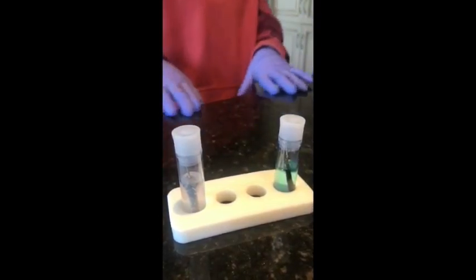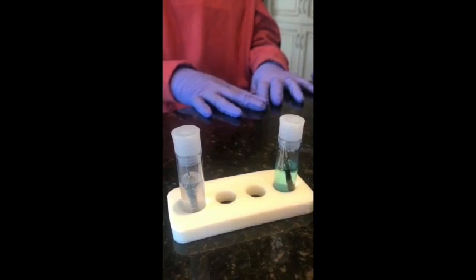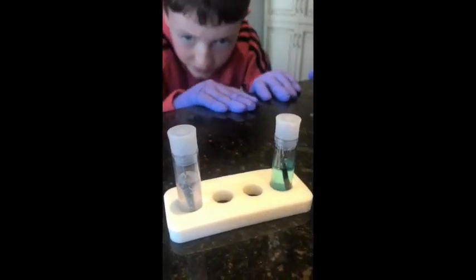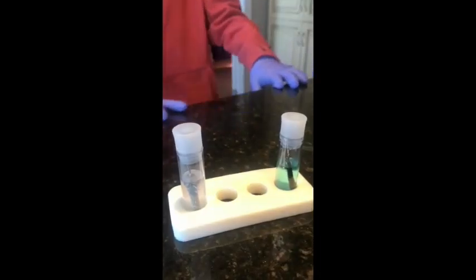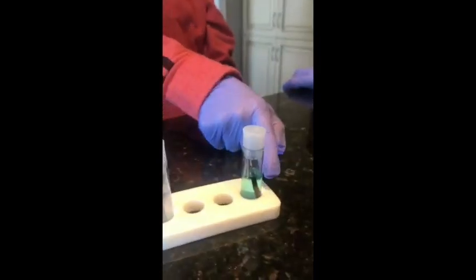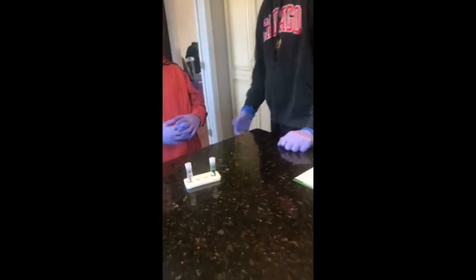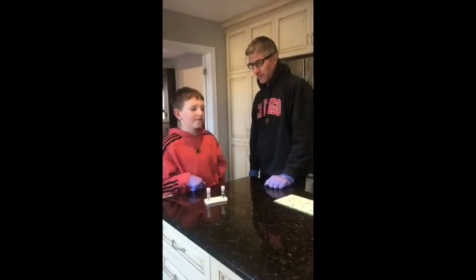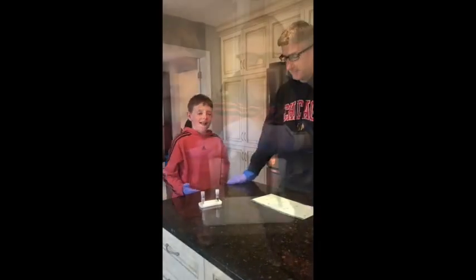Okay, is this one clear? No. Is this one more clear? Is one clearer than the other? Yeah. So one's a little bit cloudy. Can you point to the one that's cloudy? Okay, can you point to the one that's clear? Perfect. So those are more observations that we can look at as part of doing an experiment as well, right? Awesome. See you guys in a few minutes.